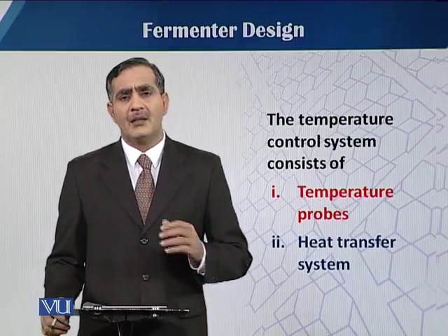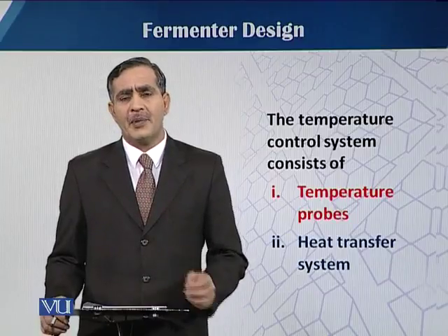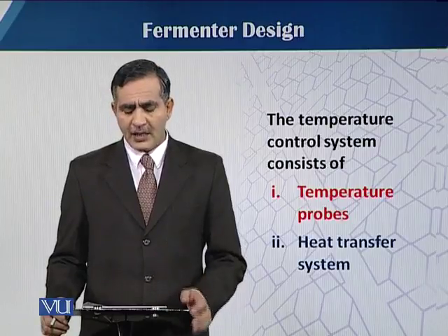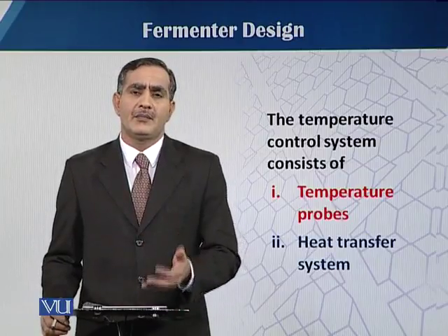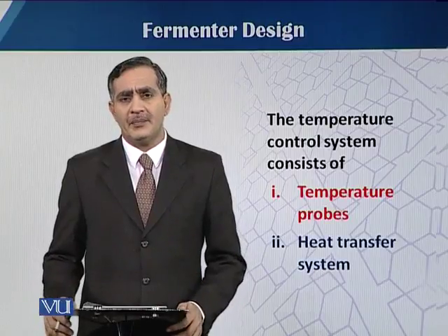One part is the temperature probe that senses the internal temperature of the fermenter, and then there is the heat transfer system that actually controls the temperature of the fermentation vessel or the fermentation medium.